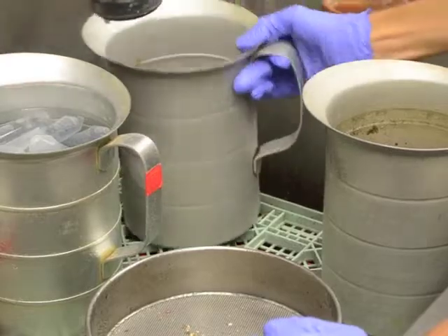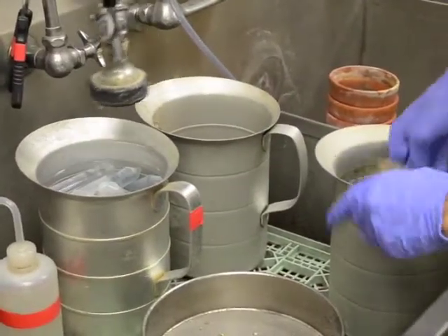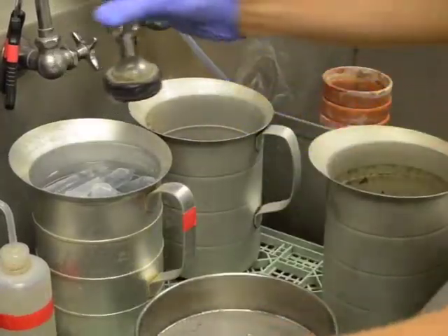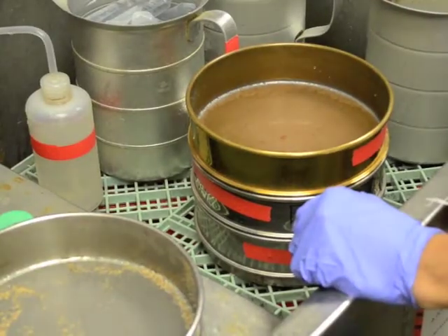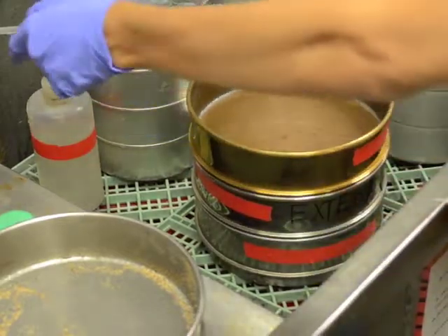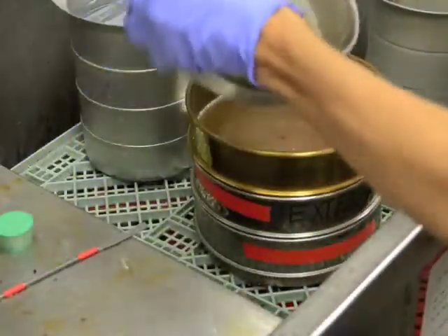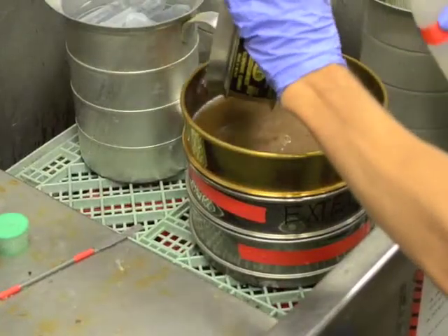Repeat this blasting of the soil with a new aliquot of soil every time until all soil has been used. Transfer the contents of the 60 mesh sieve onto a pre-wetted stack of 100 mesh, 325 mesh, and 500 mesh sieves.